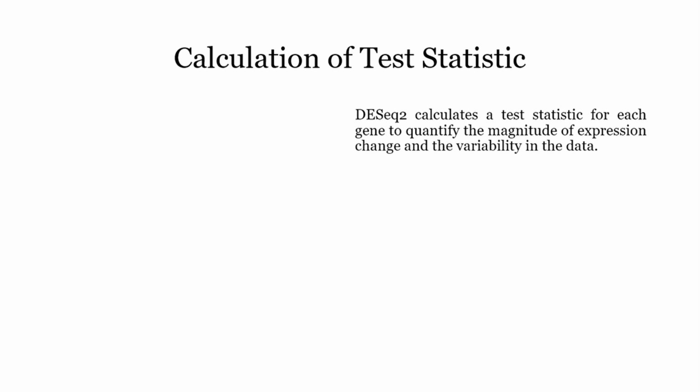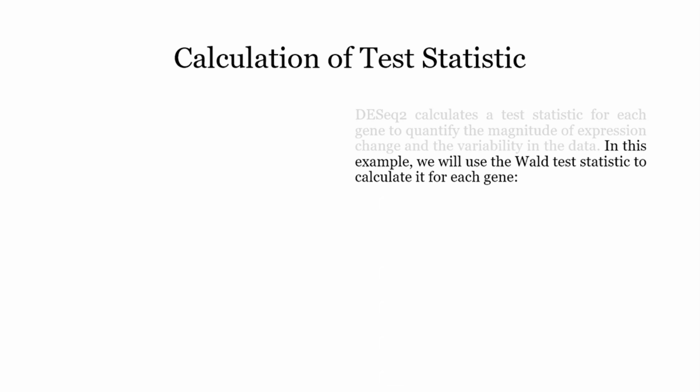And now, the calculation of the test statistic. DESeq2 calculates a test statistic for each gene to quantify the magnitude of expression change and the variability in the data. In this example, we will use the Wald test statistic and calculate it for each gene.